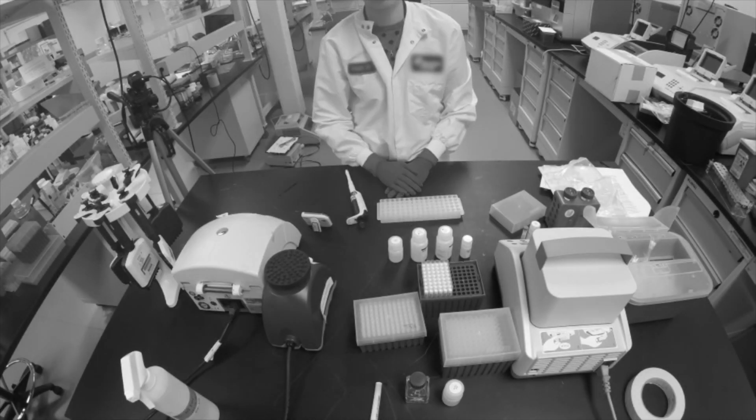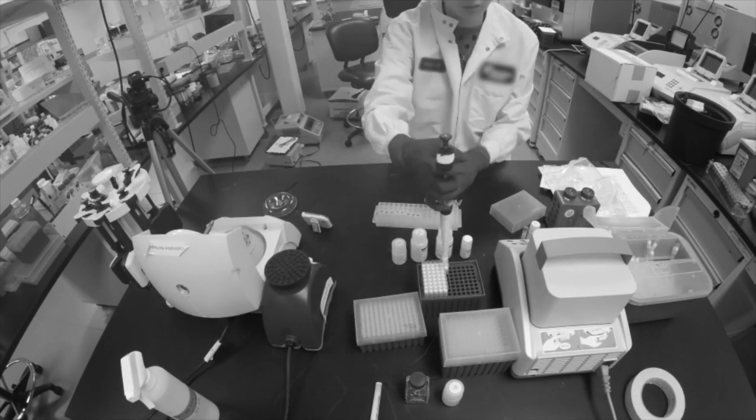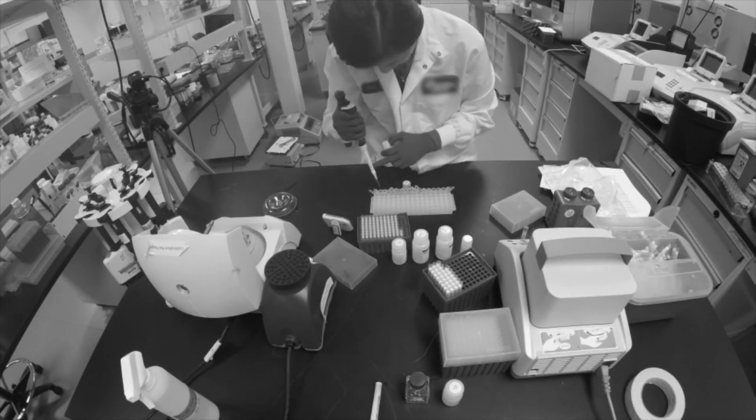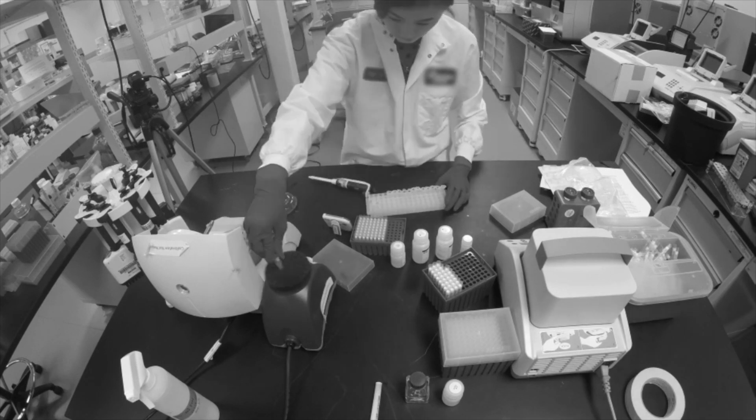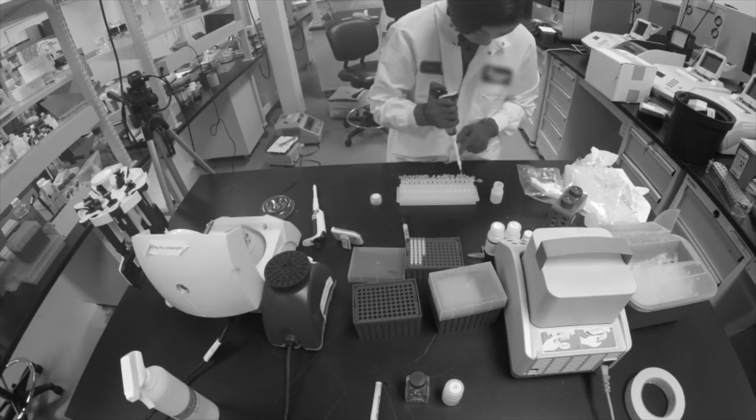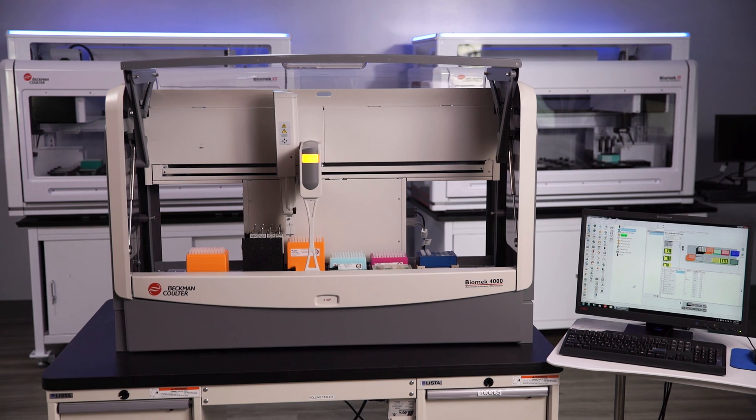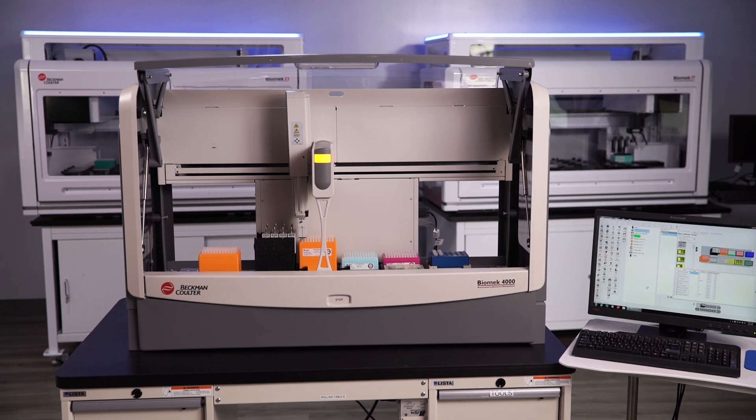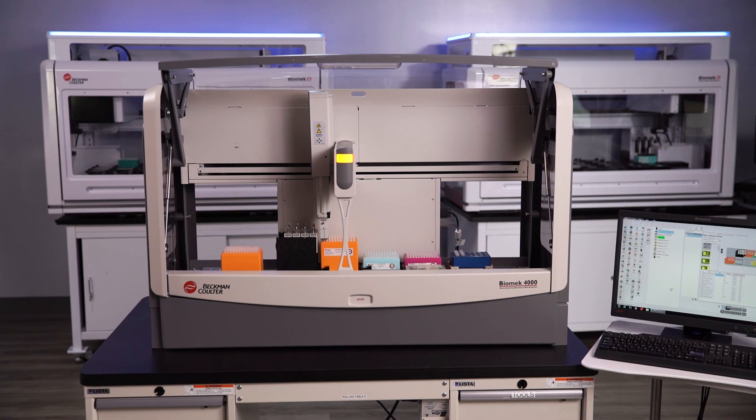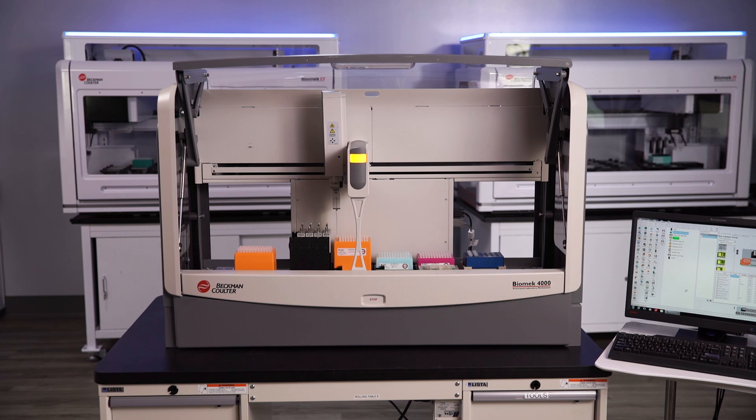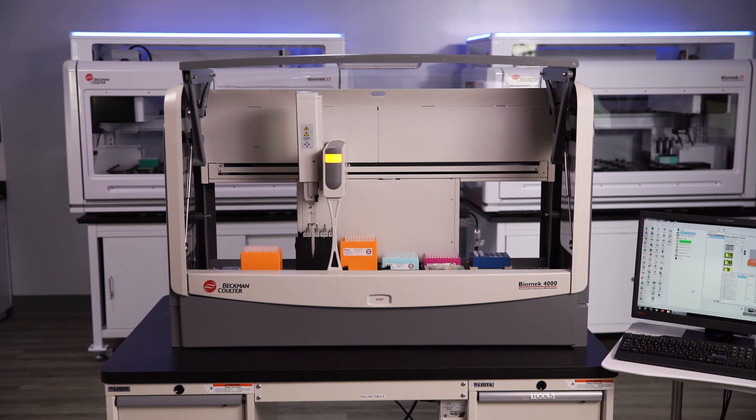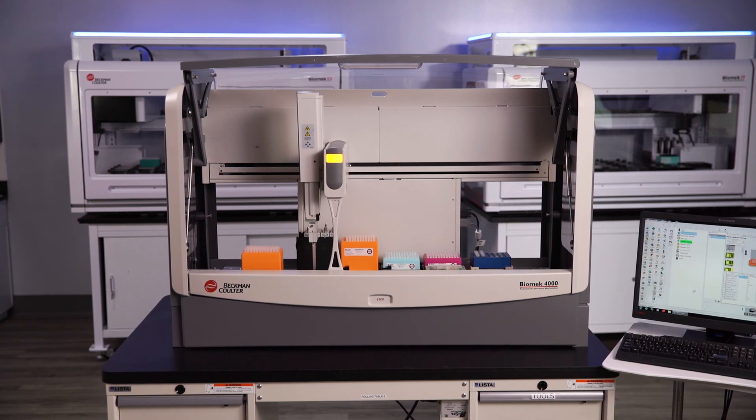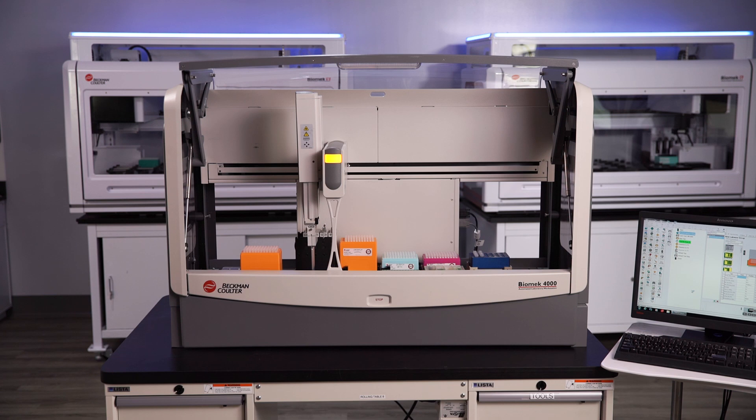The number of pipetting steps involved in today's complex research methods are both time-consuming and have the potential for costly errors. Your input and our experience led to the engineering of a liquid handling system that you can easily and cost-effectively automate for your manual methods. Introducing the Biomek 4000 from Beckman Coulter Life Sciences.